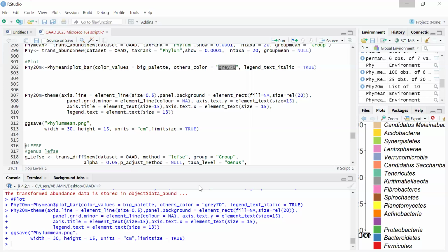Dr. Amin, how is this different from the previous one? Because I can see they are all estimating the relative abundance of the bacteria community. Which one is the previous one? Is it the line plot or the bar graph? One is the heat map. One is for genera, while one is for phyla. The second one is for phylum, the other one is for genus.